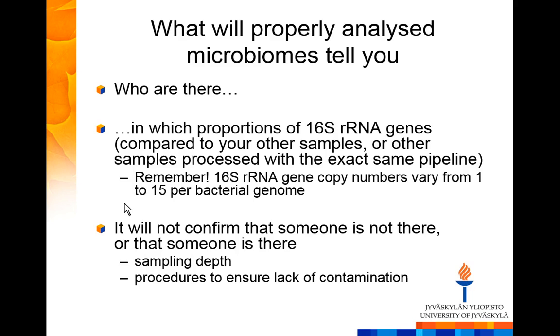Again, a reminder: what will the microbiome data tell you? Or what do you expect it to tell you? The really cool thing with sequencing is that from the sequences you learn identity. In the earlier days, we had all these microbial community fingerprinting methods like DGGE, LH-PCR, T-RFLP. By the way, how many of you have used or at least heard of such fingerprinting methods? About half, yeah.